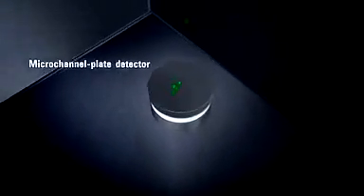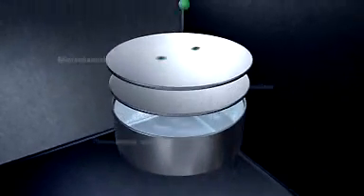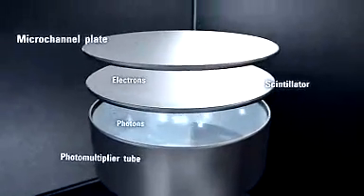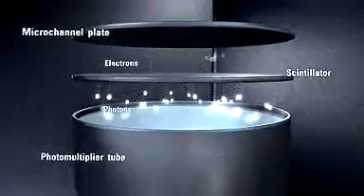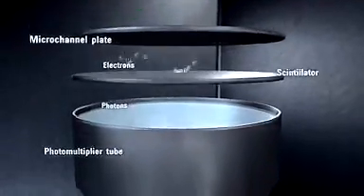The microchannel plate detector converts the ion signal from electrons to photons and back to electrons. This electrically isolates the high voltage flight tube and front of the detector from the signal passed to the electronics.